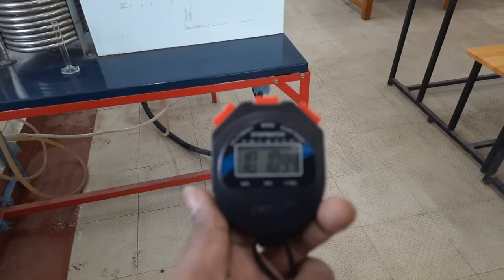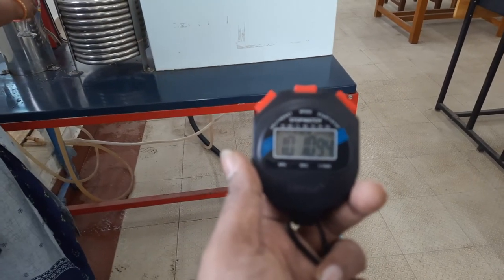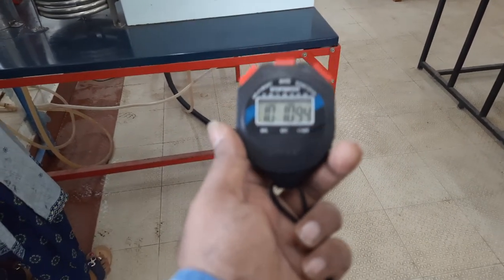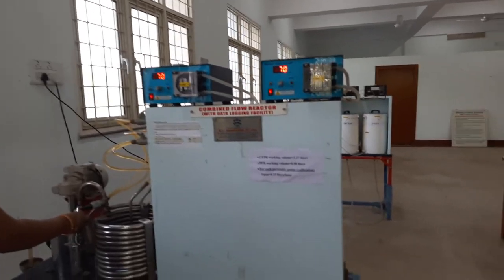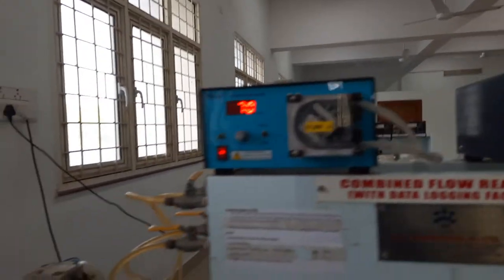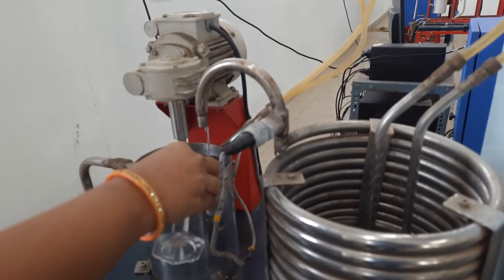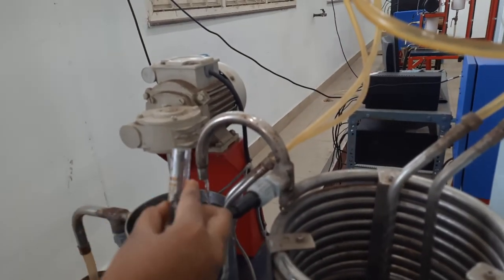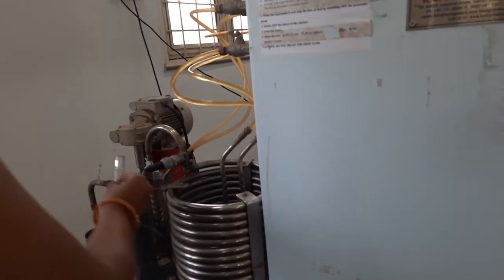Okay, it's 10 minutes now. We are going to collect the sample one from the beaker corresponding to 60 RPM. Wait for 10 minutes. After 10 minutes, for the value corresponding to 70 RPM, we will be collecting 10 ml of sample from the product stream. We collect the first batch.